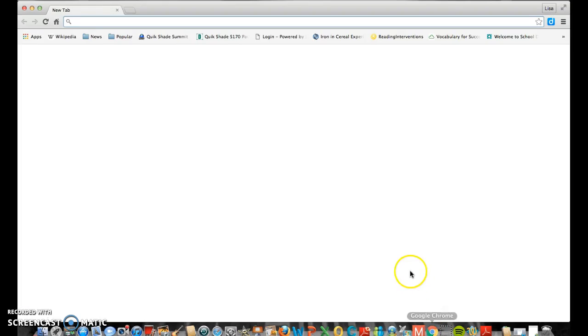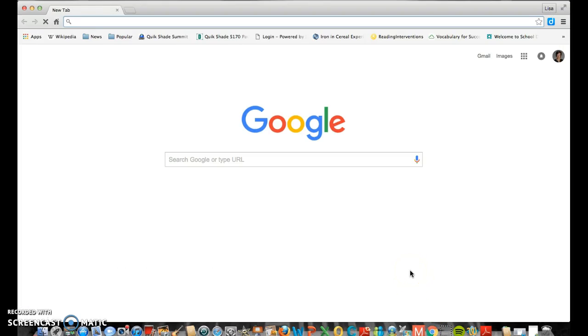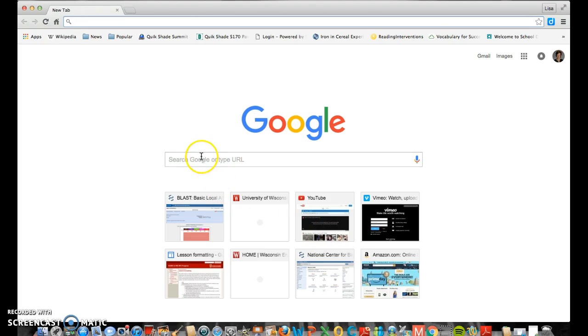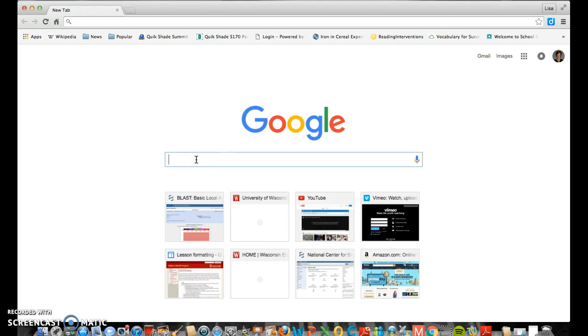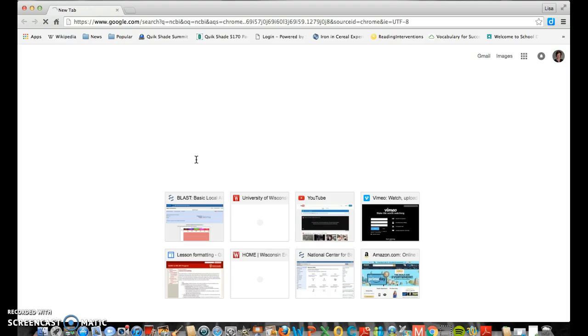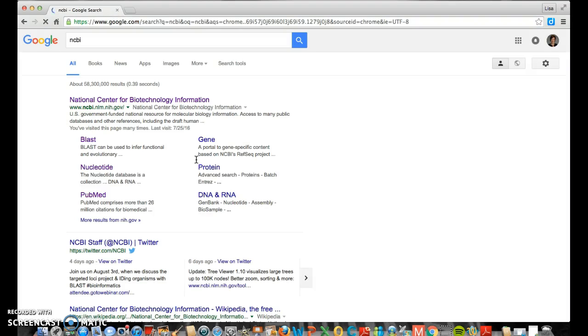So the first thing I'm going to do, I already had Mega loaded, please do that yourself. Or it will automatically pull it up for you later. I pull in my favorite browser, mine happens to be Chrome. And I'm going to pull up a website. When I put in NCBI, I get National Center for Biotechnology Information.